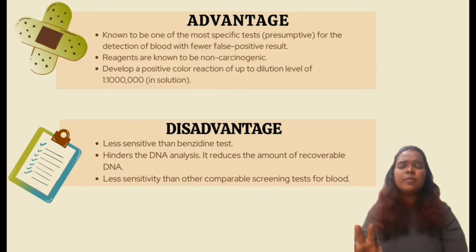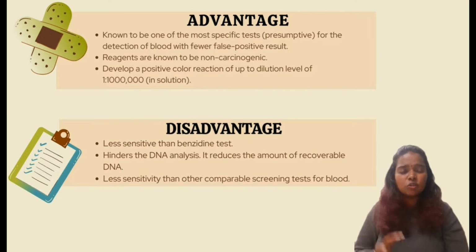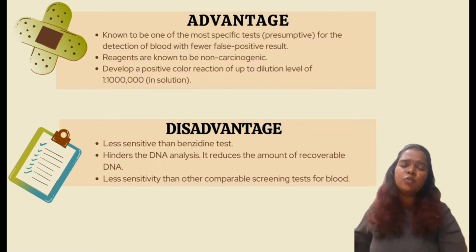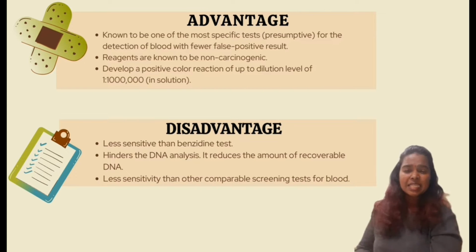So the advantage is that it is known to be one of the specific tests for the detection of blood, with fewer false positive results. Other than that, the reagent is also known to be non-carcinogenic, and it develops a positive color reaction at a dilution level of up to 1 to 1 million in solution. The disadvantage of this test is that it is less sensitive than the benzidine test. It also hinders DNA analysis by reducing the amount of recoverable DNA, and it is less sensitive than other comparable screening tests for blood.